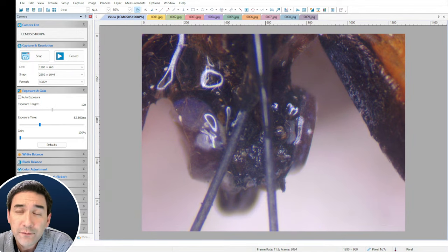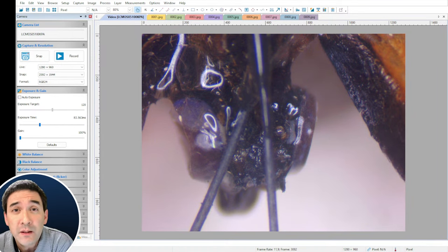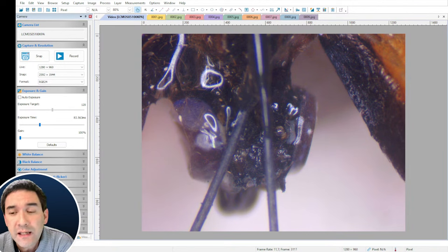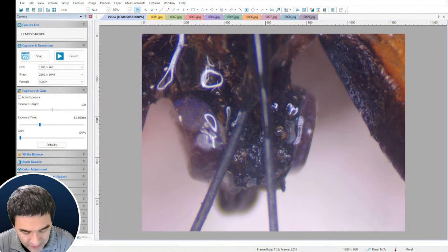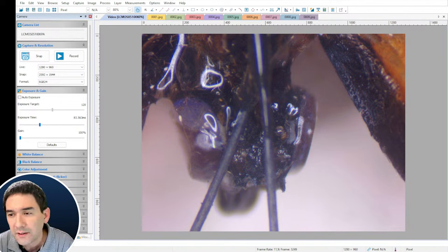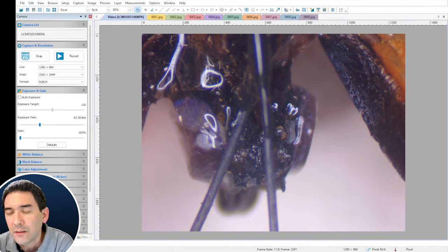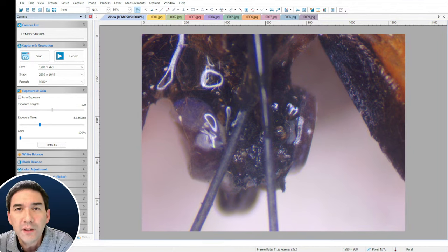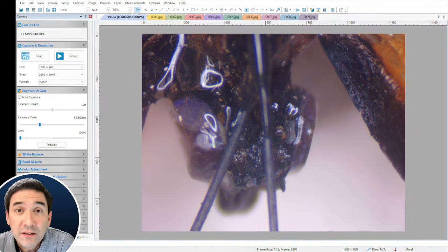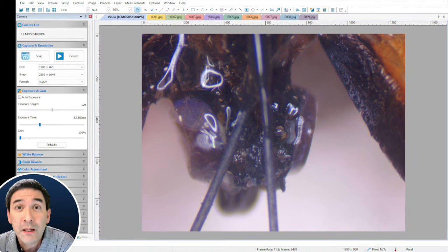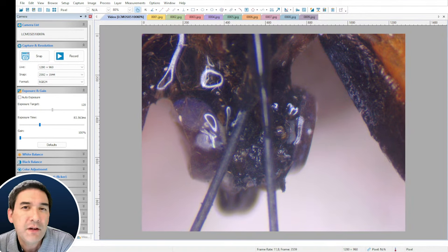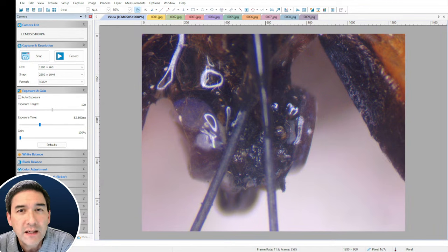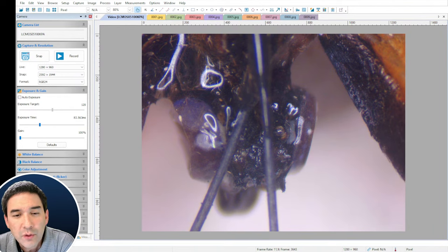Concerning focus stacking, there are different programs you can use. There is a free program called Picolet — picolet.de — it's totally free. It's a very powerful program, but not quite as user-friendly; you really have to read the documentation. For most cases, you want a very quick way to generate stack images, and for that I recommend Helicon Focus, which I'm going to show you now.